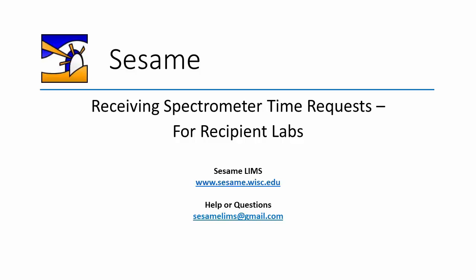This tutorial is for the labs receiving time requests and includes details about viewing and administering time requests for lab members and for lab masters. A different tutorial is also available for users who are creating and submitting time requests for spectrometer use. In this tutorial, we will be working in the Sundial module.